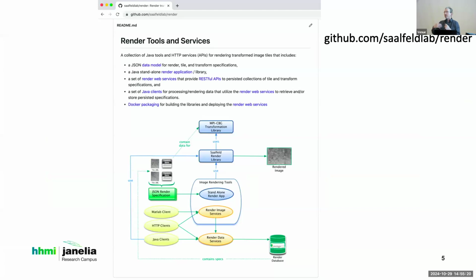There's a tremendous amount of pipelines, very large, more or less Java-oriented pipelines that run on our cluster that handle all of the alignment and the transformations necessary to bring in a variety of different types of large-scale 3D EM images into one consistent volume where a single voxel represents a certain grayscale value, and eventually will be identified as a label. What we would eventually want to get to is, in this massive 50 teravoxel volume or much, much higher, each voxel has a unique UINT64, 64-bit identifier saying this is part of this neuron, or this is a part of something else that we're interested in.